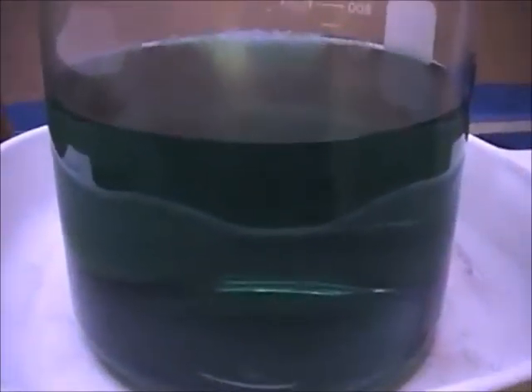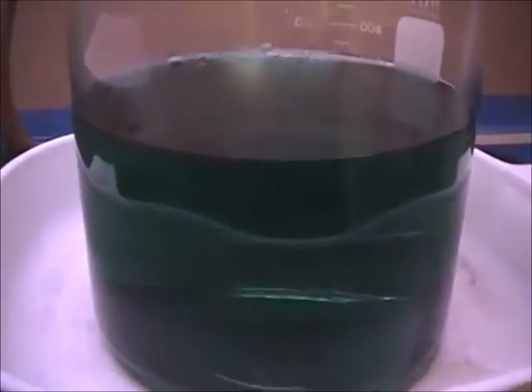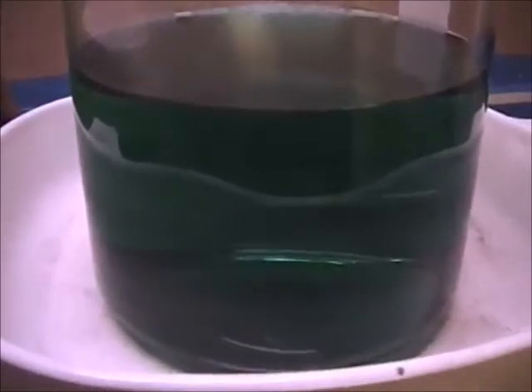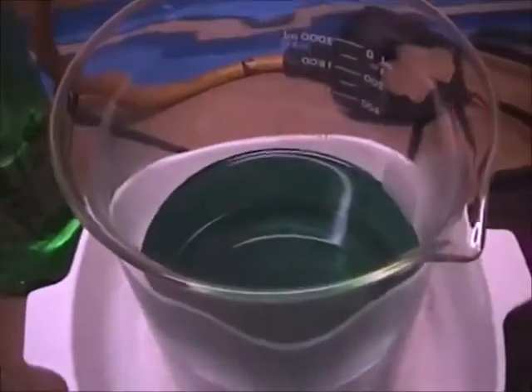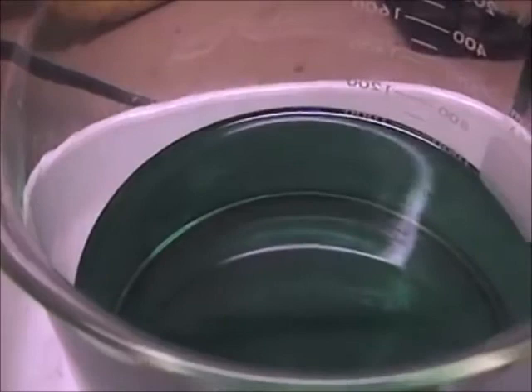A while ago I took my pH meter when the silver started precipitating from the solution. The solution pH was about 4 to 5. So the pH has to rise before it starts precipitating. Let's try getting a good focus in here. I don't know if I can get a good shot from the side or not. That may work for y'all.